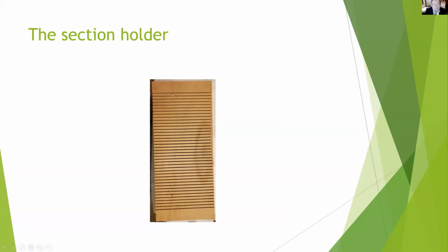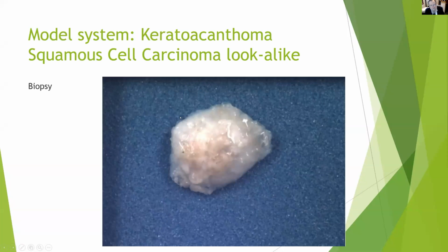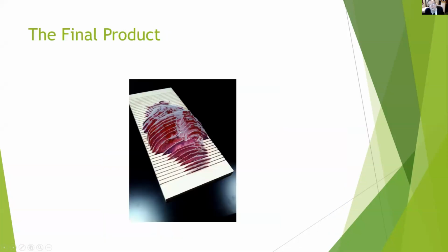Call this an invention, whatever you want to call it. I asked my engineering people to prepare a wooden board, and we made slits in it. So now, starting with this, no idea what's in here. The final product looks like this. This is not copy paper, but a little firmer. It has to be flexible enough to go through a copying machine, but firm enough to stand up like this. So you get the shape of the tumor.